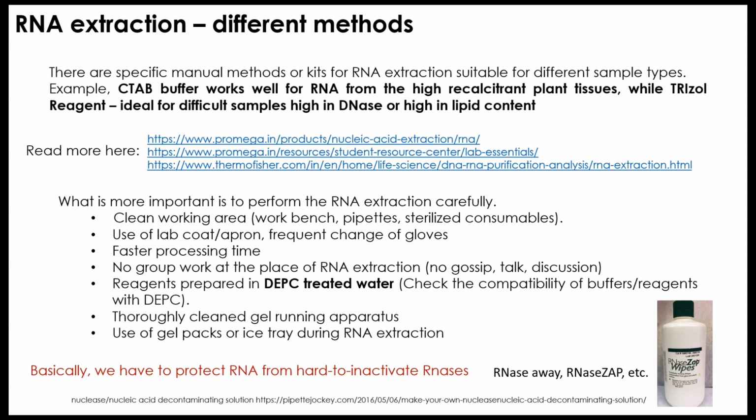Once you are very confident that the water is fully mixed with the DEPC, you can keep it overnight, and then the next morning you take it out and autoclave it. It is very important to autoclave because the DEPC has to be degraded before you use it for any other purpose, right? Some of the reagents, for example Tris, may not be compatible with DEPC, so you always have to make such buffers in DEPC treated water. It means after the autoclave, when you are very sure that DEPC is not there in the water, right?